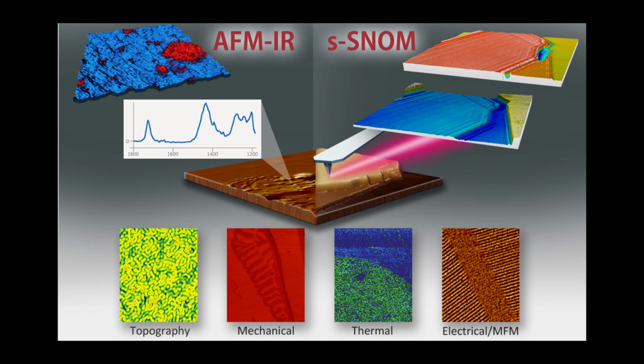There's a question about is it possible to get quantitative mechanical analysis to get the modulus from the contact resonance frequency measured. So a couple things I wanted to mention on that. One is just to remind people that there are two ways to get those mechanical property measurements. One from the contact resonance in the AFM-IR measurements, and then separately from that, Lorentz contact resonance.